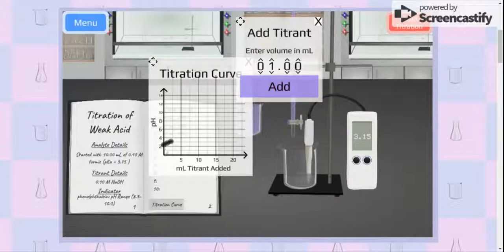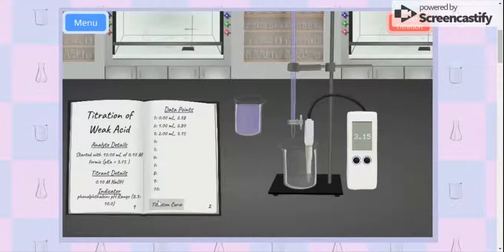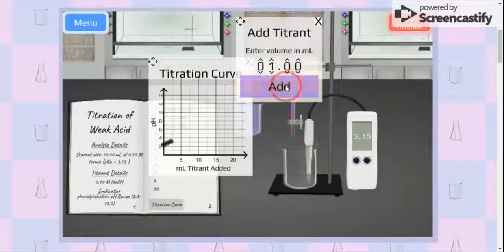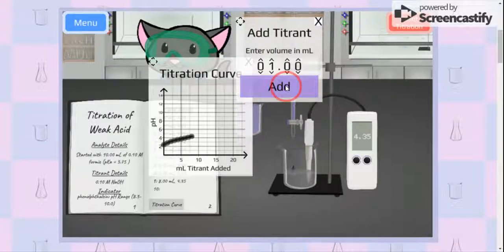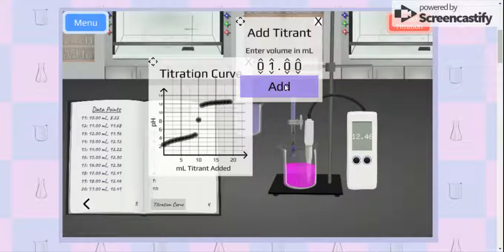Now see what happens again with the titration curve when I add. Does this start at the same place or not? So I can switch this down so you can see the starting. Otherwise, let's keep on adding and see how this differs. So there's our 9, turn the page. What is the same and what is different?